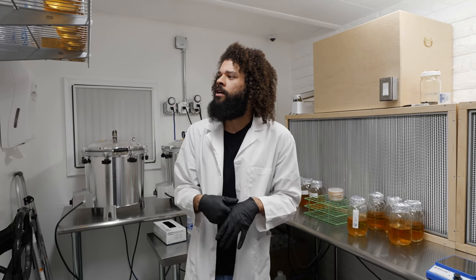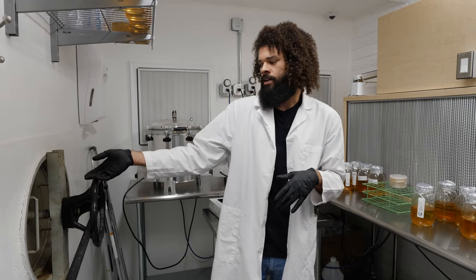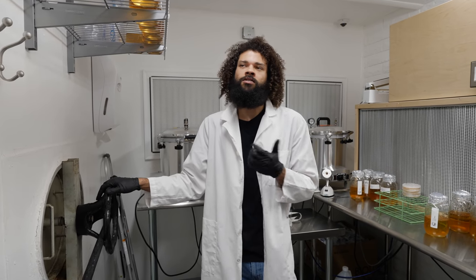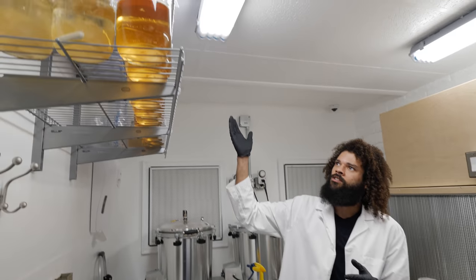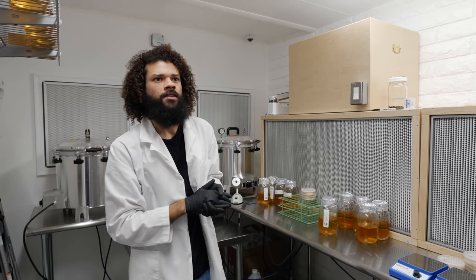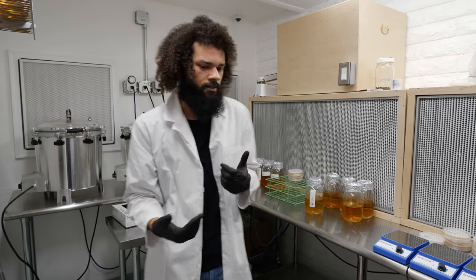The room is mainly focused on liquid cultures and spawn production. There's an autoclave built into the wall — a horizontal autoclave that you can load from the opposite end and unload right here directly into the clean room. This just helps with the production of spawn and maintaining cleanliness. We can also store petri dishes, colonizing cultures, and nutritional media and ingredients used to make up certain recipes for liquid cultures and agar slants.